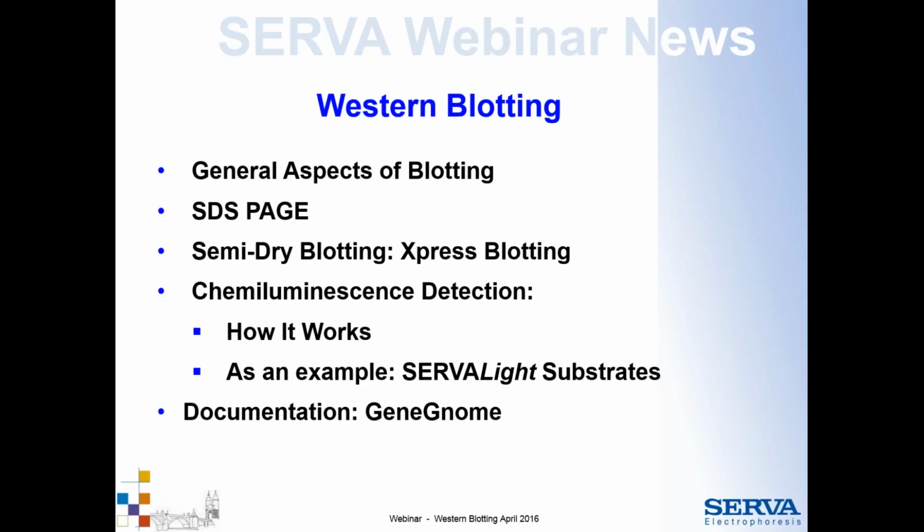So during my talk I want to go to the following points. I will give you the general aspects of blotting. Then I will show you the SDS page products for fast SDS page. I will give you an insight into semi-dry blotting, the general procedures, and especially the XPressBlotting procedure.